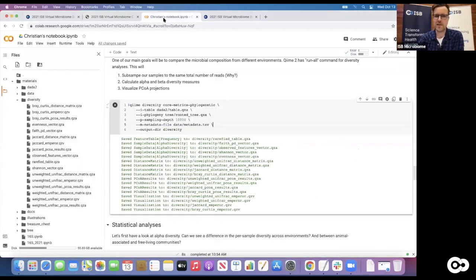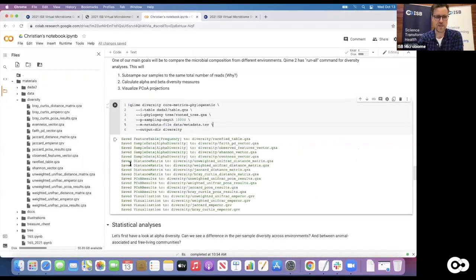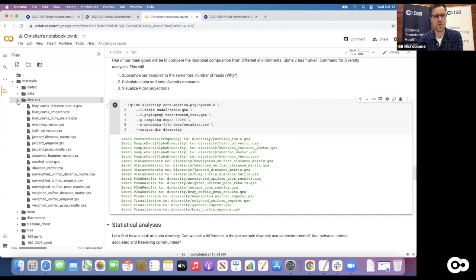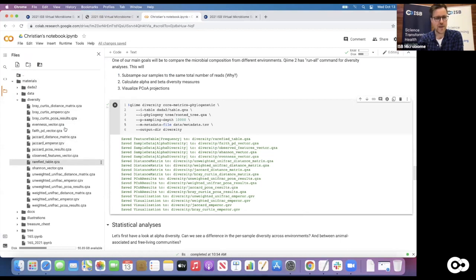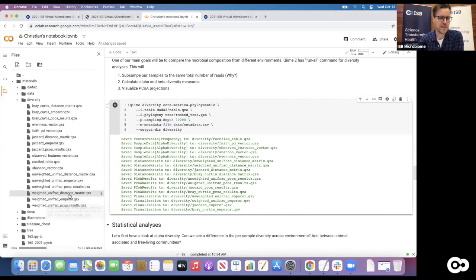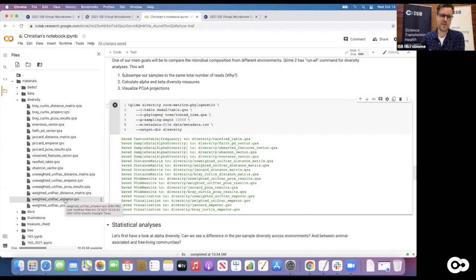So we can look at that visually by opening some of those visualizations. When we ran that command, it generated a lot of visualizations all in the sub-folder called 'diversity' which is in the materials folder. If you open that up and refresh, there are a lot of files here, named by the distance matrix they used and what they did. We're interested in the QZV files - and we might start with the weighted UniFrac emperor QZV file, which uses the weighted UniFrac distances.